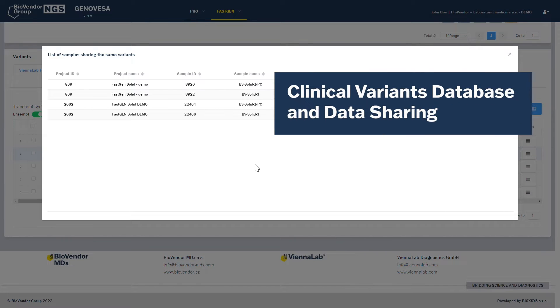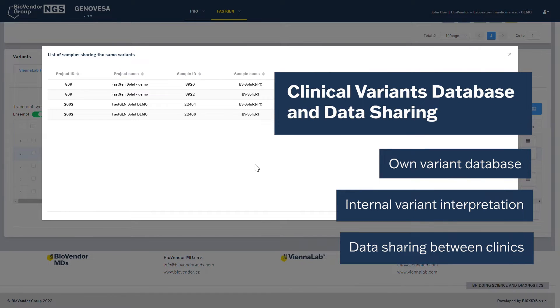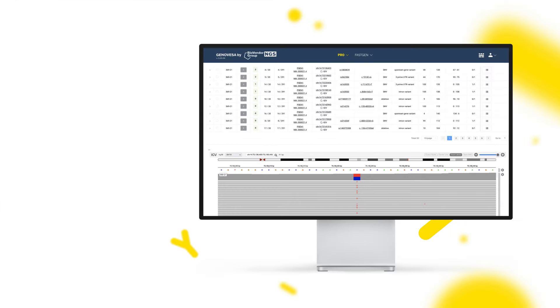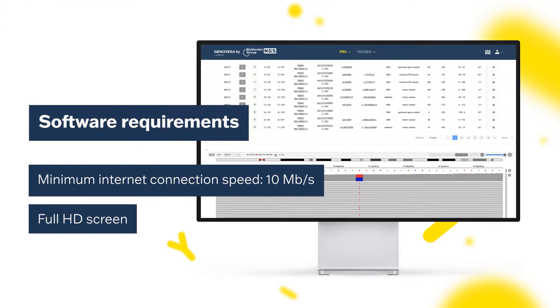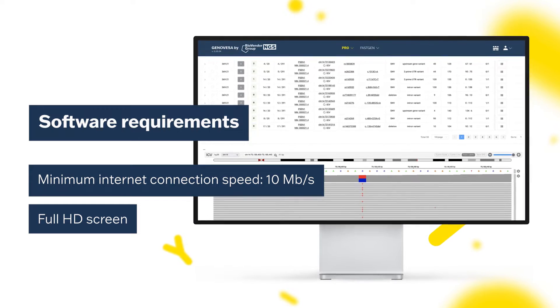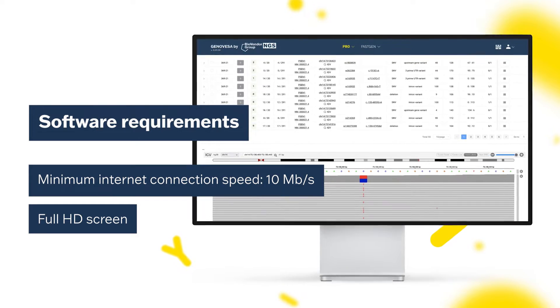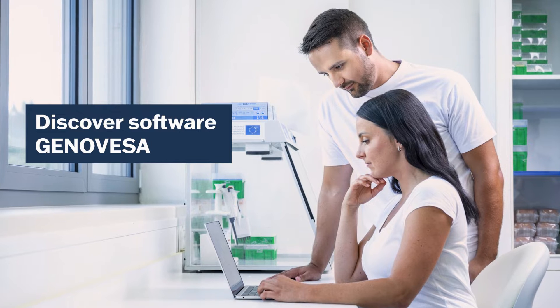Use Genovesa as a database for storing variants and find clinically relevant information quickly and accurately. Share data seamlessly among individual clinics. Software requirements are a minimum internet connection speed of 10 Mbps and a full HD screen. Discover software Genovesa.